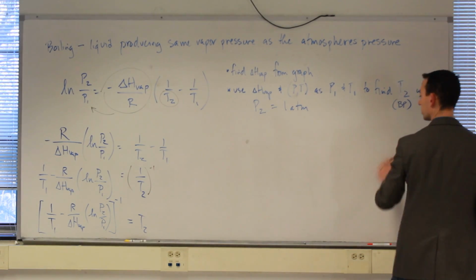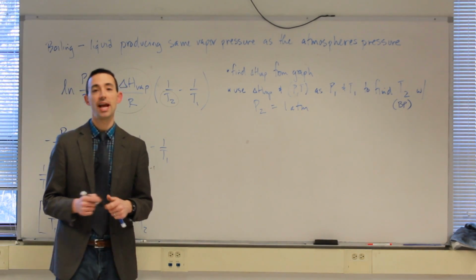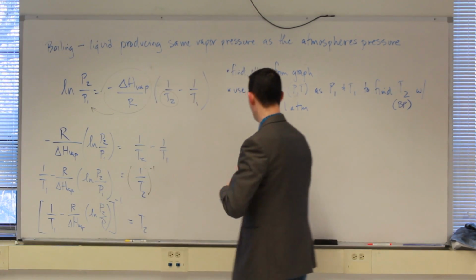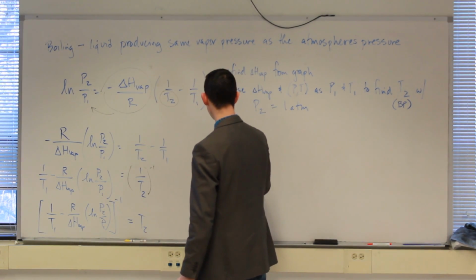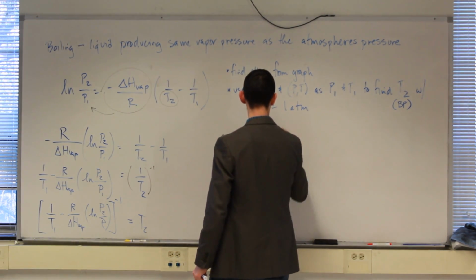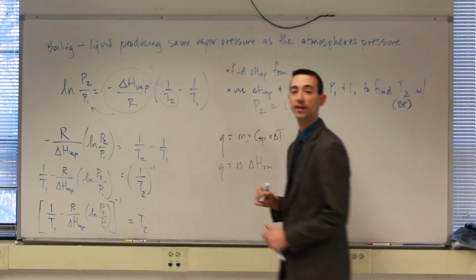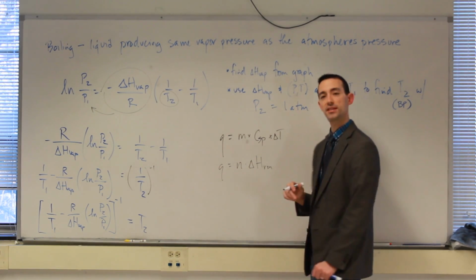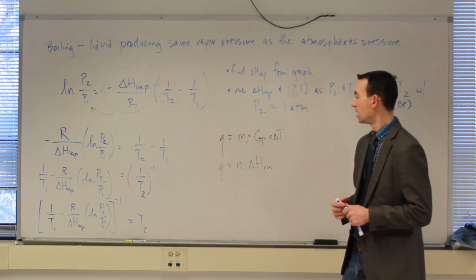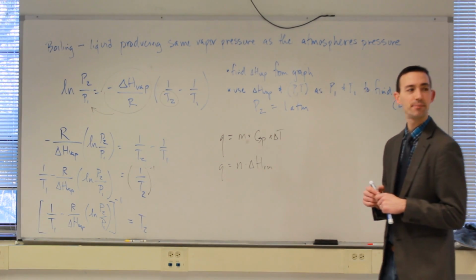One last thing, I've already talked a little bit about two of the PreLab questions. The first PreLab question asks about the amount of energy required when vaporizing a liquid. So liquids, when they vaporize, do so at constant temperature. Now energy, heat specifically, is quantified in only 2 ways we've learned already this semester. These are the only 2 formulas that we've used to calculate the amount of heat required to do something or that's released. I just said a second ago that vaporization occurs at a constant temperature.